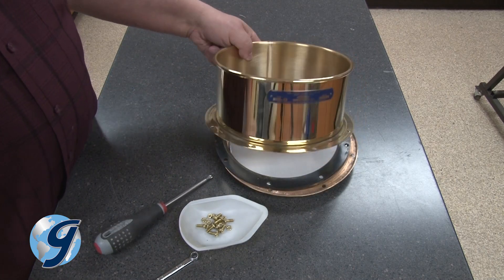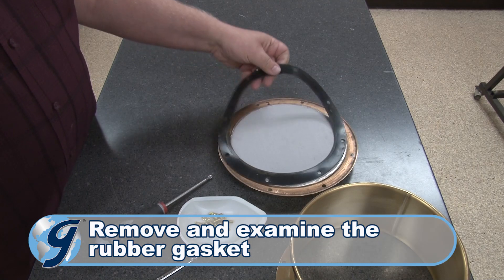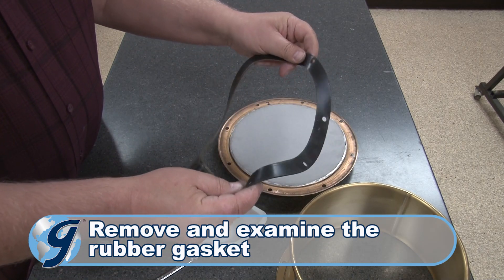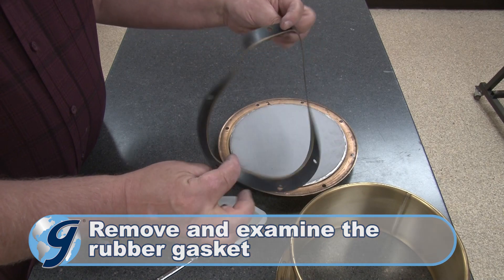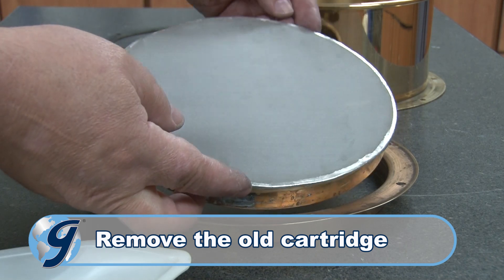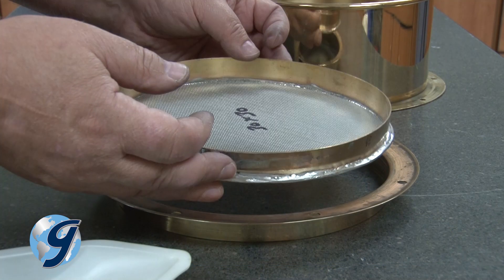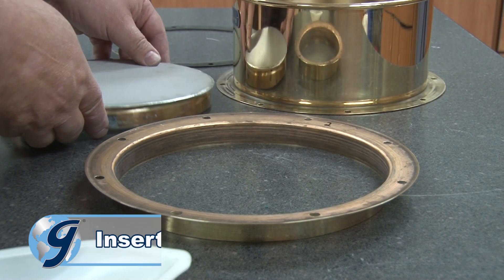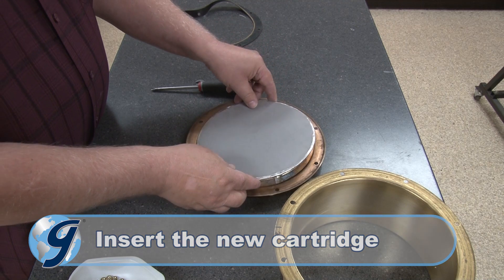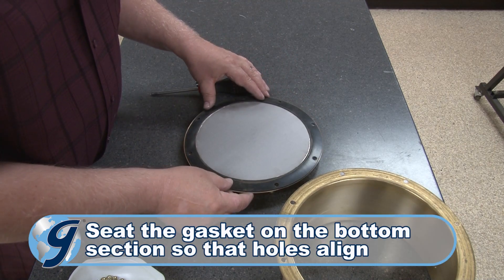Now carefully remove the rubber gasket and set it aside. Next, remove the cartridge from the bottom section of the sieve and set the old cartridge aside. Now place the replacement cartridge into the bottom section of the sieve.